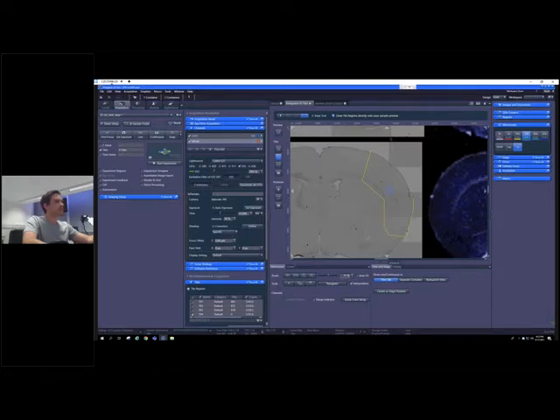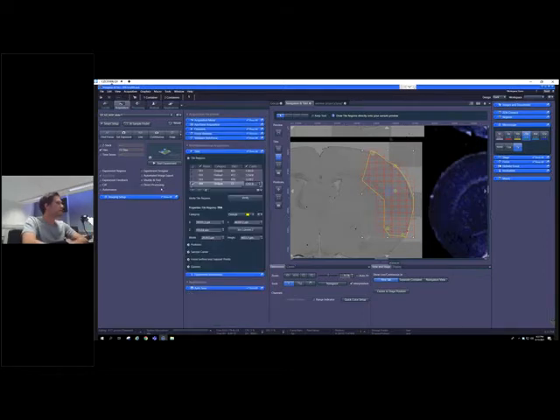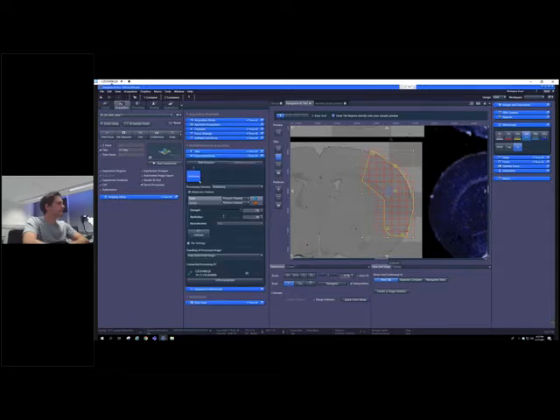So we can directly use the online processing functionalities we have, which is a module named direct processing. And this is what you can find here on your left-hand side tool. And within the direct processing, I'm assigning now a function called deblurring, and we'll run this directly on the fly, and we'll have the software opening the images automatically after finalization.